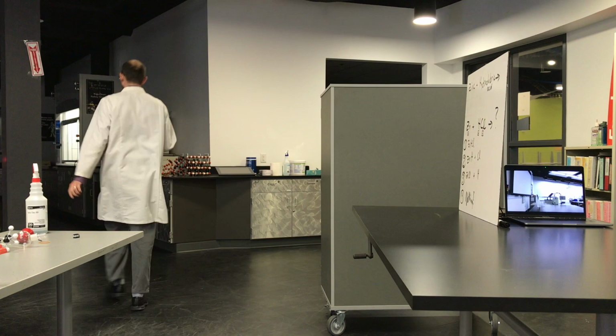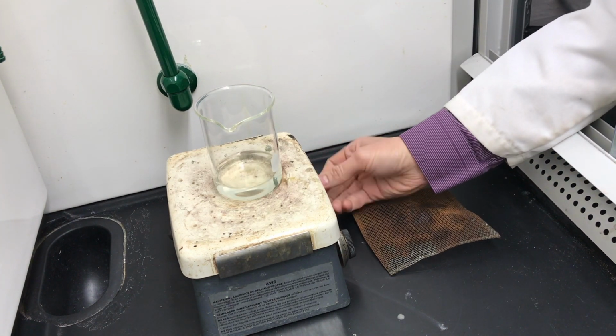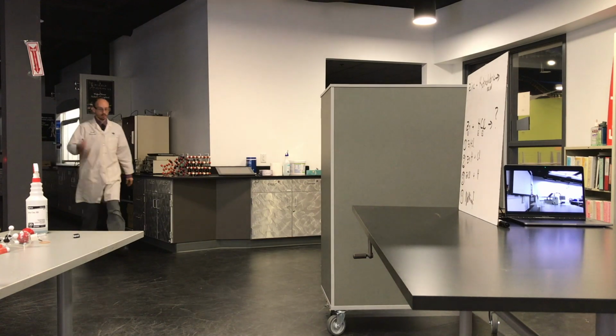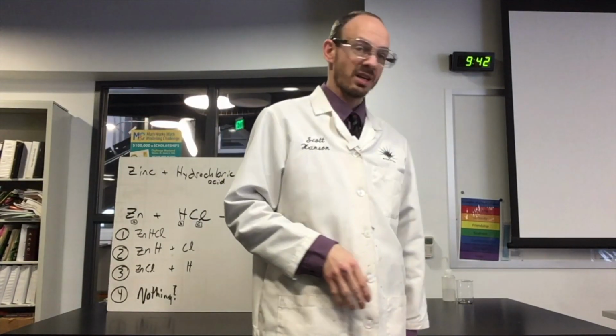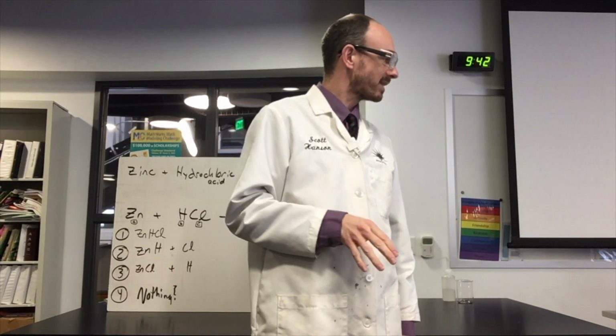So let's get this back in the fume hood, and heating. And I'm going to let that roll inside of the fume hood. So we're just going to take a quick break and watch that roll, but I'll speed up the video. We'll come back together after that's done.